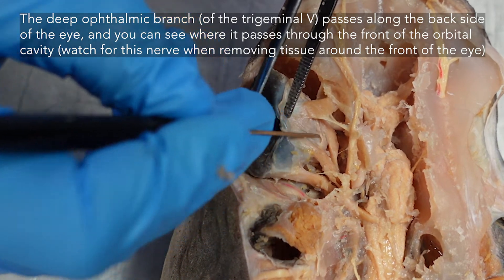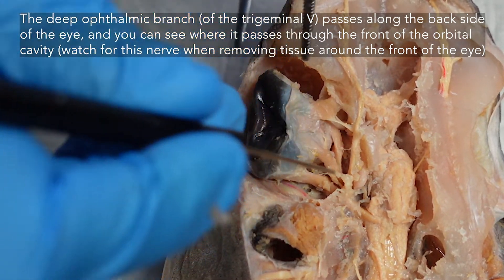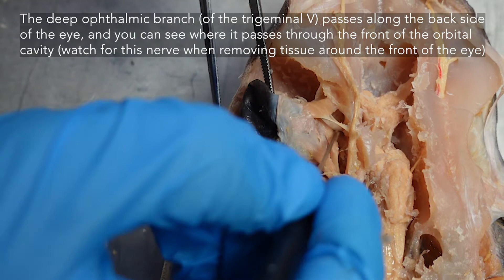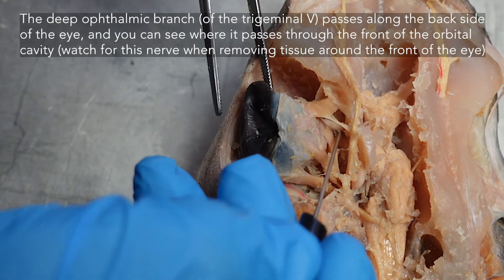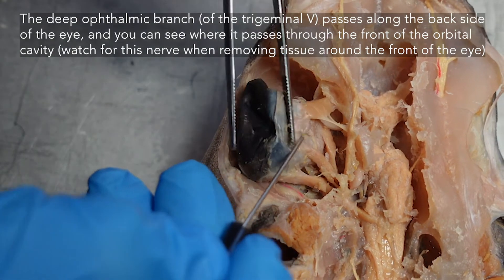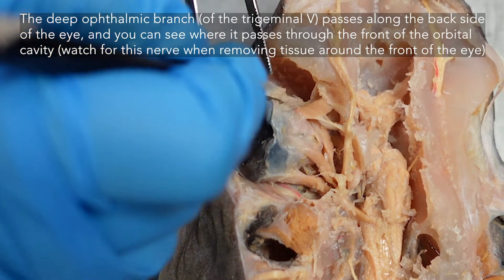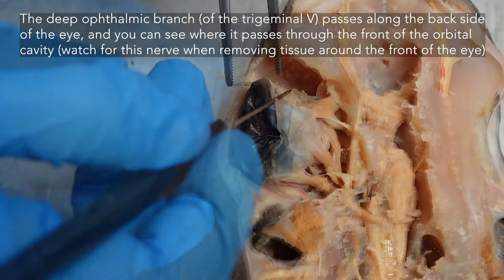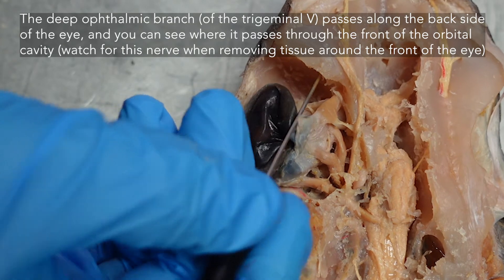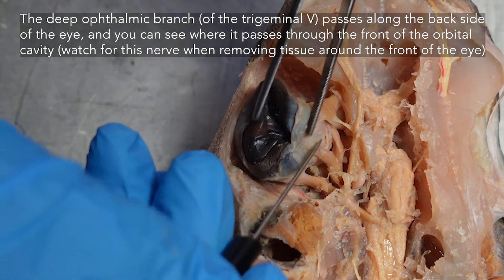If you follow the deep ophthalmic nerve, even though it's going across the back of the eye, notice that it is not going to any of the eye muscles — not to your superior oblique, not to any of the rectus muscles that are moving the eye. Peer down there for the optic nerve — a fairly robust nerve underneath. We're following that deep ophthalmic nerve of the trigeminal forward; it continues toward the rostrum and would pass through this anterior orbital shelf running parallel to your superficial ophthalmic trunk.